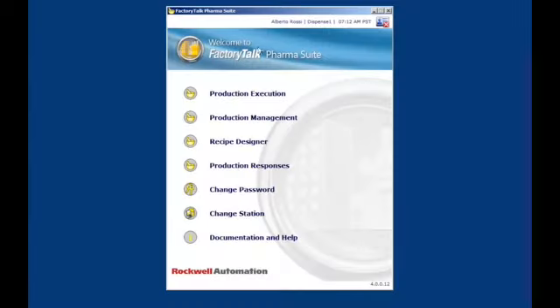To begin, we are logged into the system as the dispensing operator and viewing the PharmaSuite welcome page. Here is the user's name, for this example, Alberto Rossi, who is currently connected to the system. The page also shows the work center we are connected to, Dispense 1.